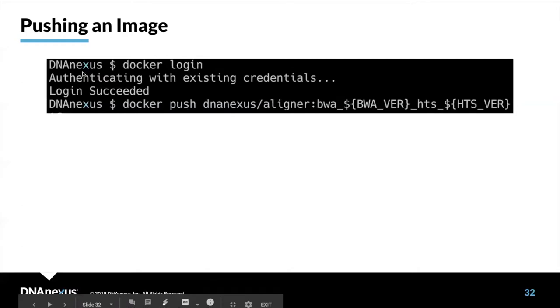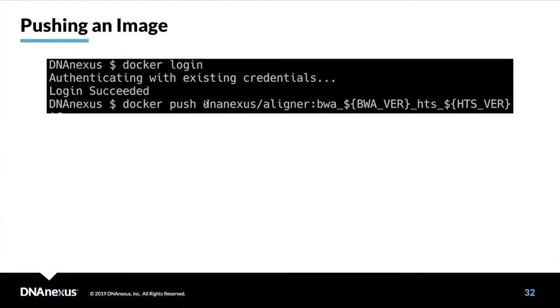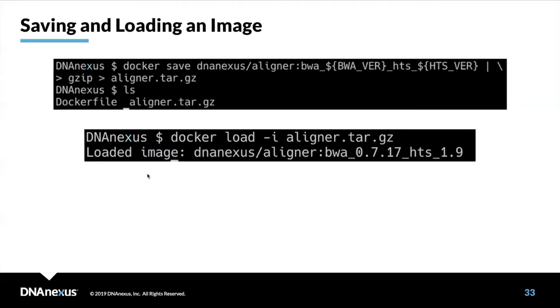To push an image, you just use the docker push command followed by the image name. You may need to do a docker login ahead of time if you're logging into a secure repository — for example, if you've deployed a repository at your company that requires credentials. To save and load an image, you do docker save followed by the image name; this generates a stream to standard out of the tar file, so you pipe it optionally through gzip and save it to a tar or tar.gz file. To load it, you do docker load with the -i option, giving it the tar or tar.gz file, which loads the image into your local Docker image cache.